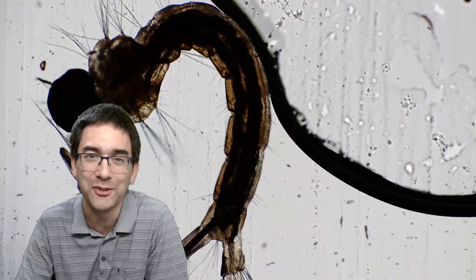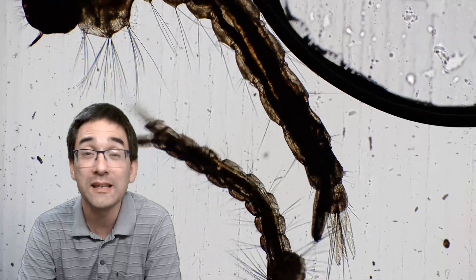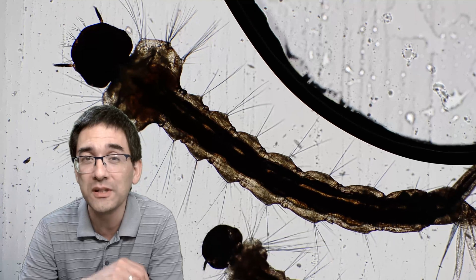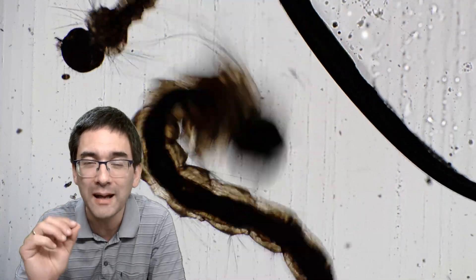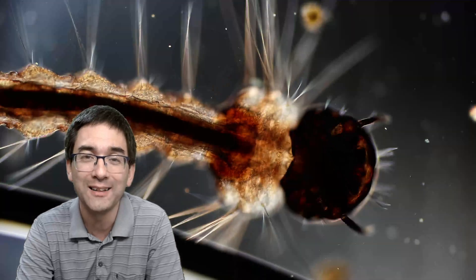Now if you look very carefully, the back side—the tail, so to say—of this larvae is actually used for breathing. You don't see it here quite well, but what the larvae do is they like to swim to the surface of the water and they like to put their little back end into the air, and this is how they're able to breathe.